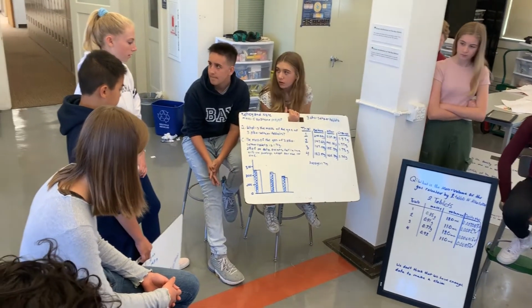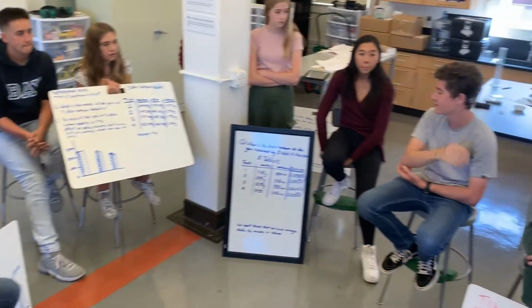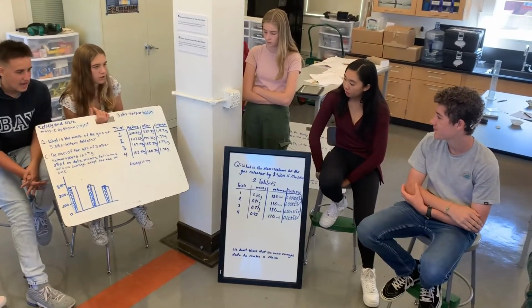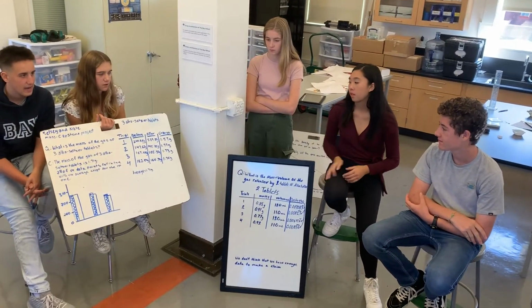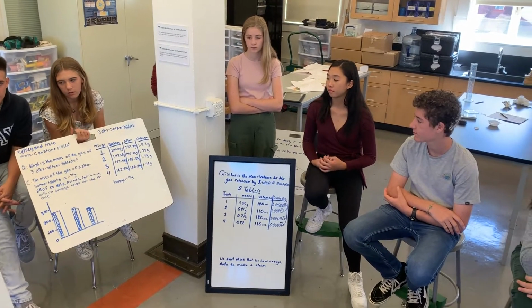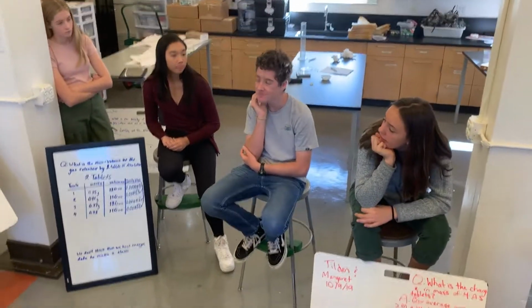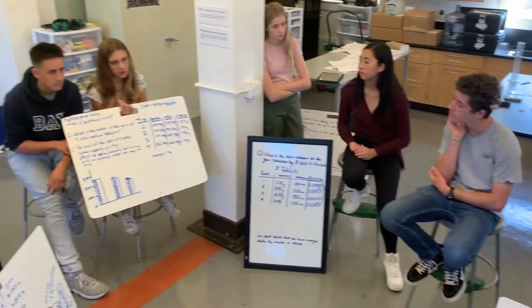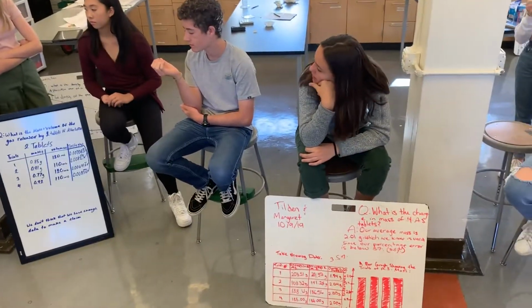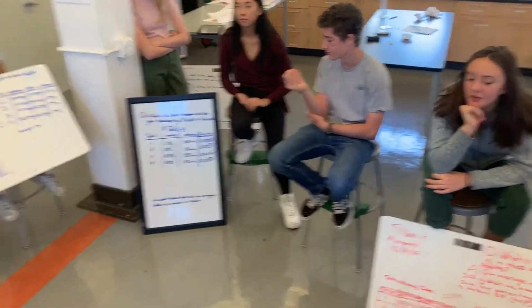Is the measurement in grams? Yes. So you changed your strategy, what does that mean exactly? We used less water in the buckets of the beaker. When you say mass of the gas, how are you measuring the gas? Well, it's the change. Right, but how are you measuring the gas? Oh wait, never mind, that's a stupid question.